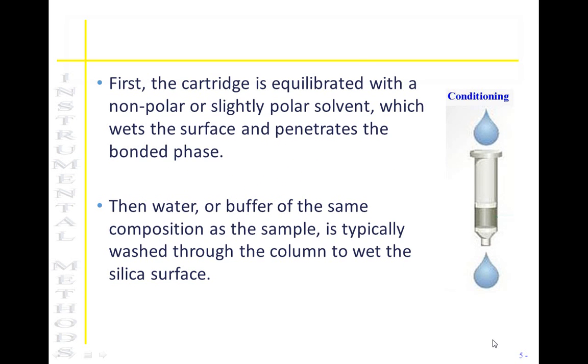When performing the solid phase extraction, there's a cylinder very similar to the one on the slide that contains a slightly small area of solid material, which is going to attract that analyte and trap it. The column itself needs to be conditioned, so usually a series of liquids is passed through the column to wet the material.